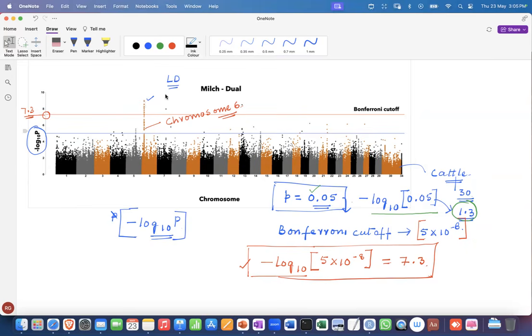You understand my question? I am giving you the complete practical aspect of understanding GWAS. You analyzed it, you know the fundamentals, how to feed the data, what gets into the software. Now, this is the output that is constructed, and this plot, which I probably missed, is called the Manhattan plot. So we have certain fundamentals to look into, to see whether our GWAS analysis is good enough or not.